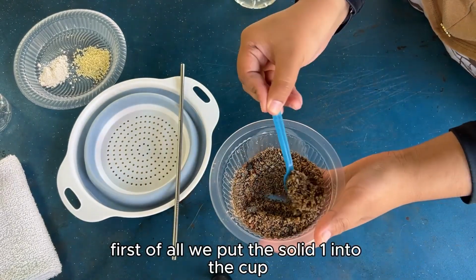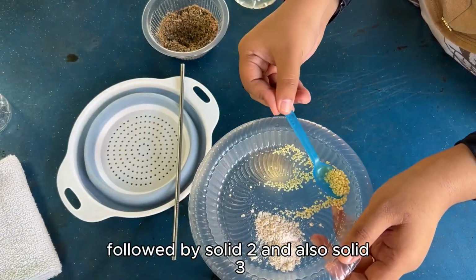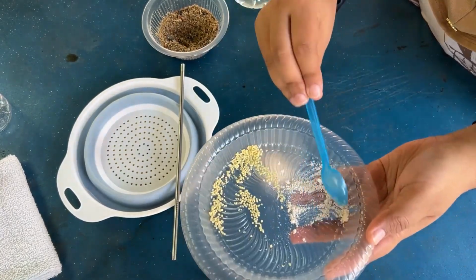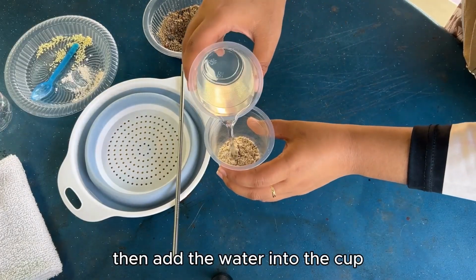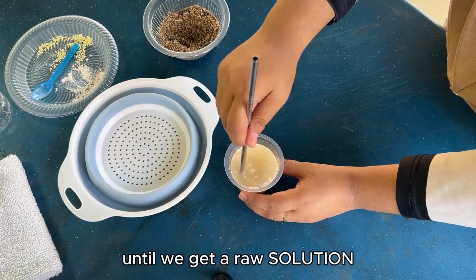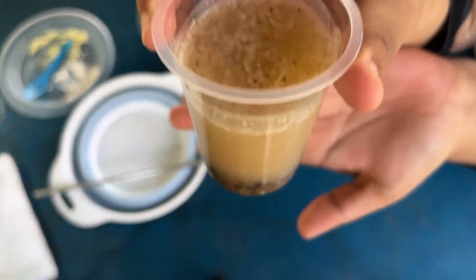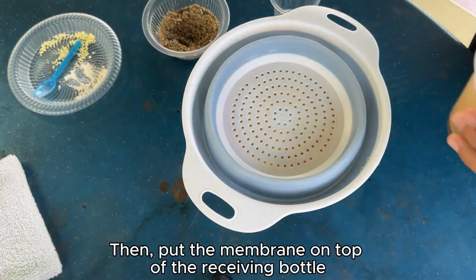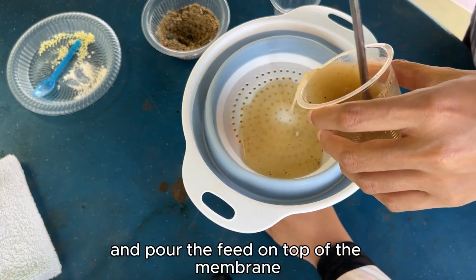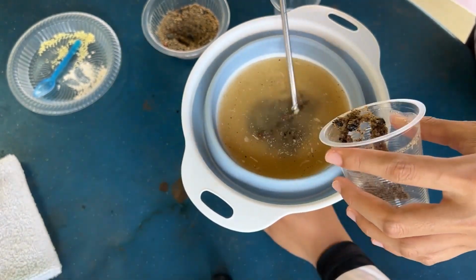First of all, we put the solid 1 into the cup, followed by solid 2 and also solid 3. Then, add the water into the cup. Next step, we stir it until we get a raw material, or we can call it feed. Then, put the membrane on top of the receiving bottle and pour the feed on top of the membrane and wait until our feed is separated.